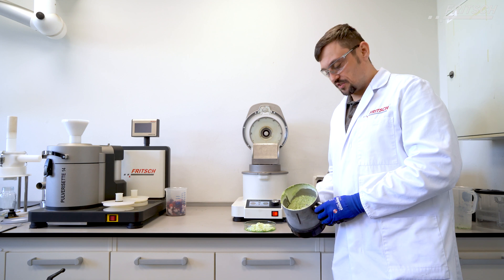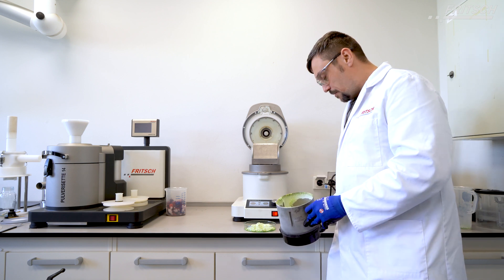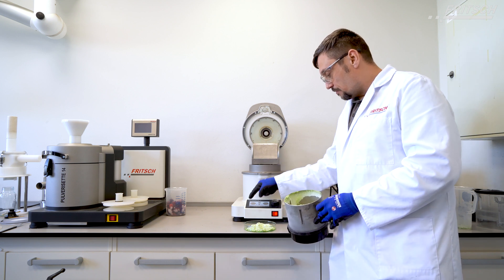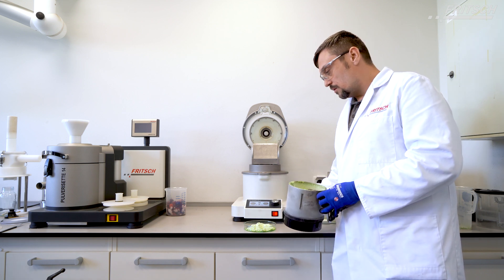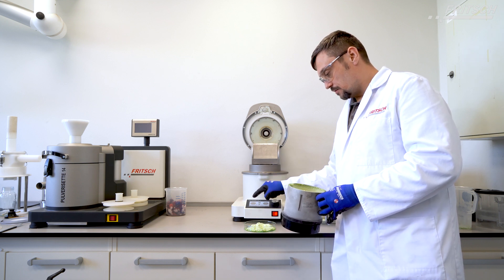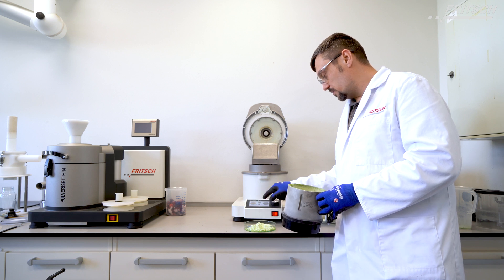For a more homogeneous result, it is possible to repeat the whole step again with the cryo mill and let it run for several seconds at 10,000 RPM. The most effective grinding method is full speed — 10,000 RPM — for a few seconds, then stop.